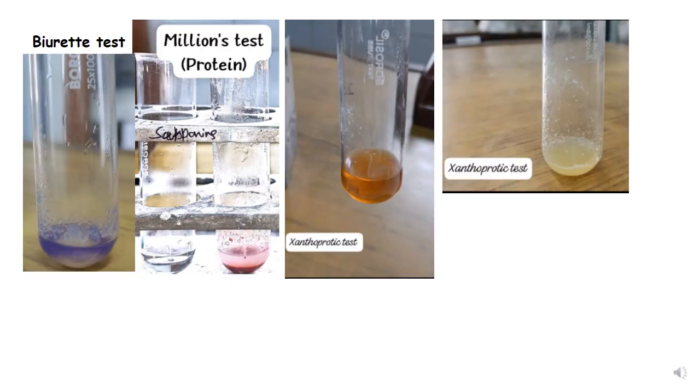So here you can see the results of the biuret test, Millon's reagent, and xanthoproteic test.